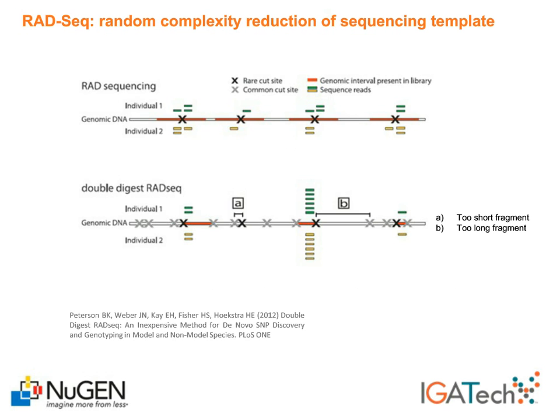Some well-known examples of complexity reduction are restriction enzyme-based, the so-called RAD, restriction-associated DNA, or GBS. Some protocols rely on the sequencing of every fragment involved in a restriction cut. Others instead rely on two enzymes and library fragment selection, which can provide a more precise and dedicated complexity reduction.